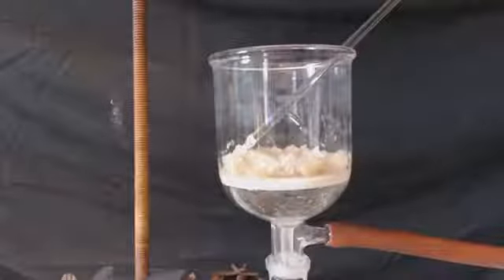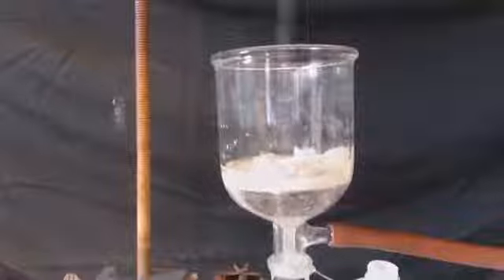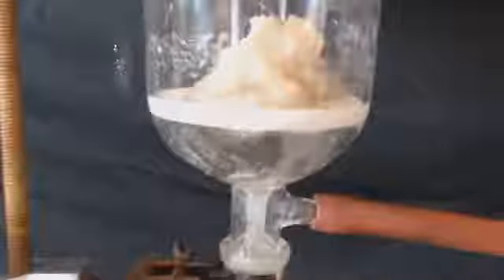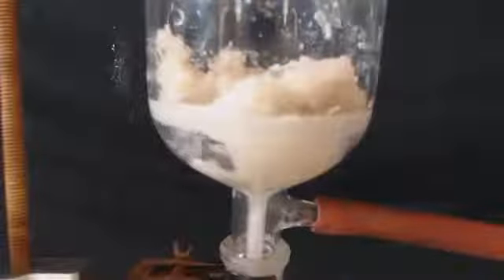I'm going to pour some ice cold water in there. Well, there it is. I'm going to see if I can also recrystallize some of the rest of that liquor. Now I seem to have the same problem. It either gelled up or it turned into a complete solid, and I couldn't wash out the crystals. So I'm going to filter it. And there you go, second batch.